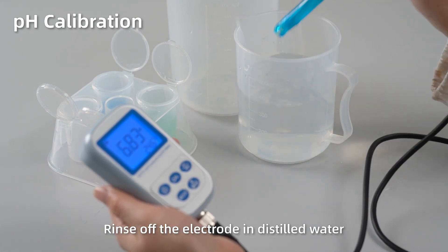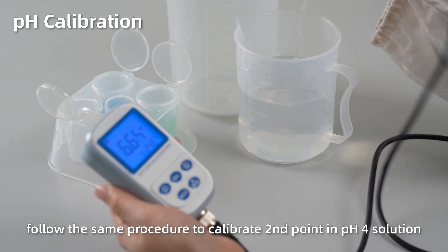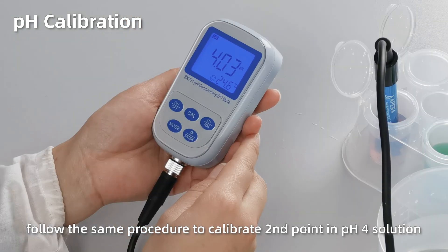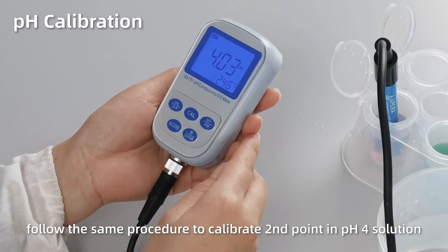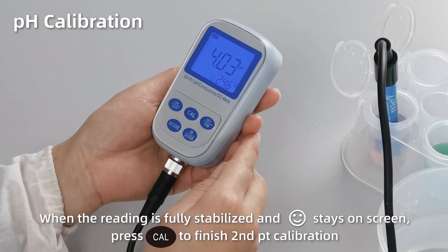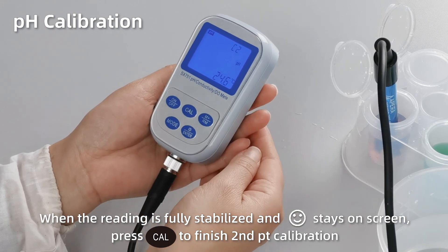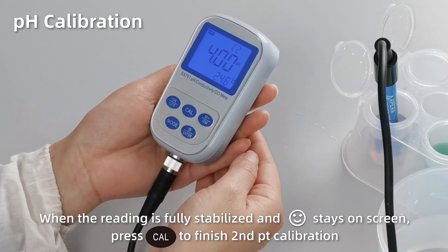Rinse off the electrode in distilled water. Follow the same procedure to calibrate the second point in pH 4 solution. When the reading is fully stabilized and the smiley face stays on screen, press Cal to finish the second point calibration.